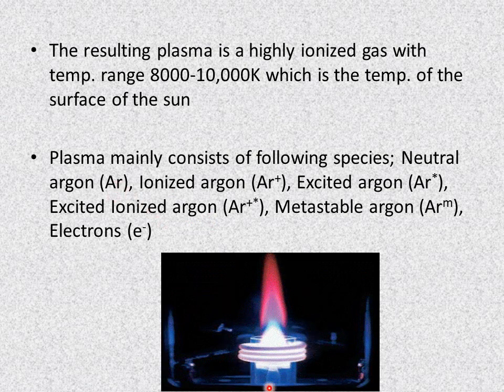And here's the photograph of plasma. So you can see clearly how it looks like. Here are the induction coils, and here is the plasma.